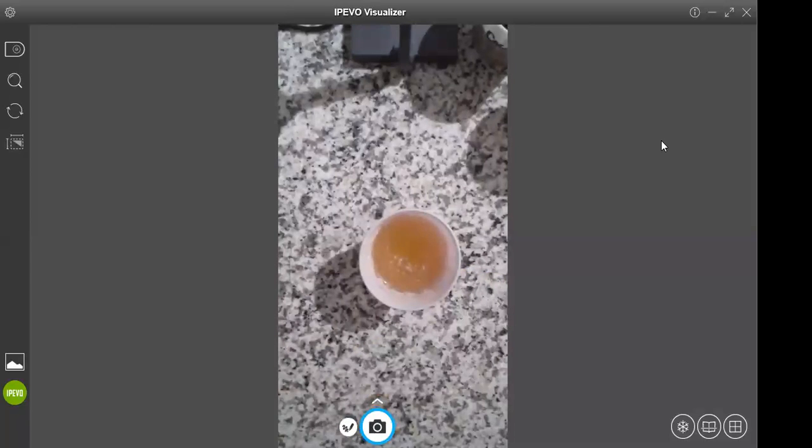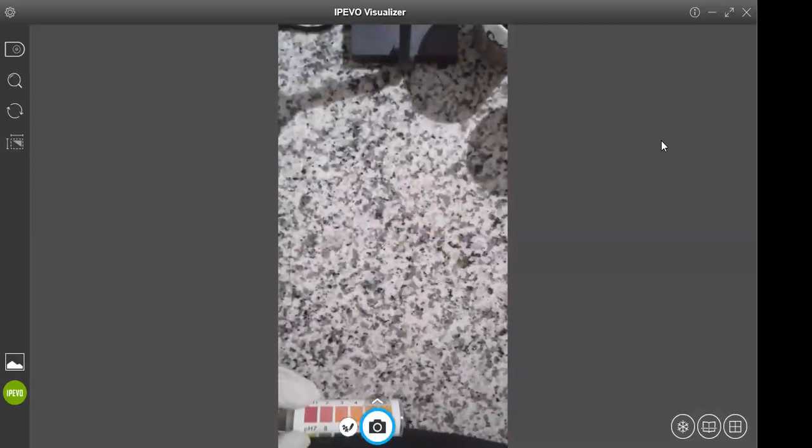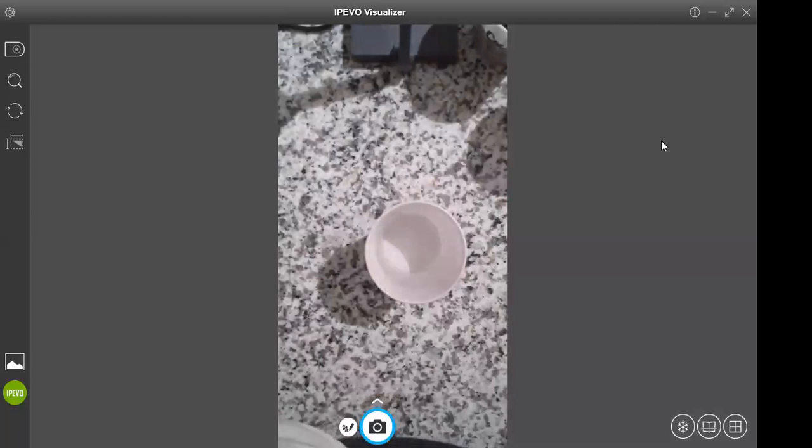And that was solution 5. That was Tums. Solution 6, let's do something you definitely see every day, and that's water.